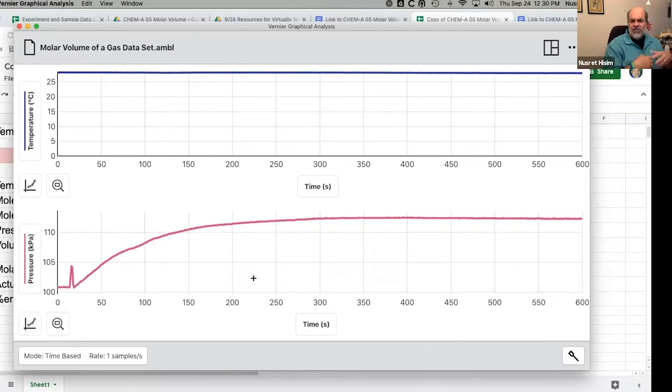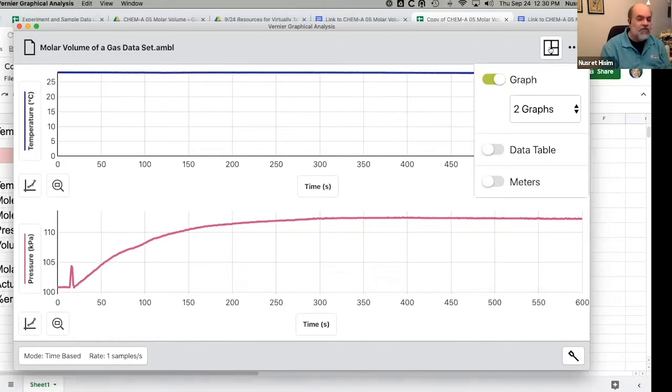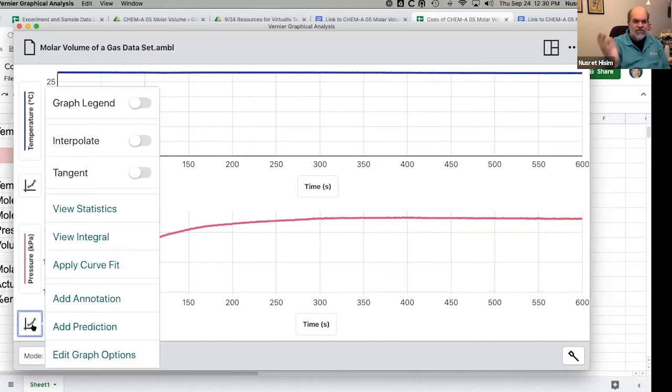Lots of other things in Graphical Analysis you don't need for this experiment, but if you're going to use the software, explore the settings box and the graph tools icon in the bottom-left corner — there are legends, interpolations, and other things you can fiddle with. Before I plow on to something else, does anyone have any questions about anything we've talked about so far? No questions have come in yet — feel free to put them in the Q&A.